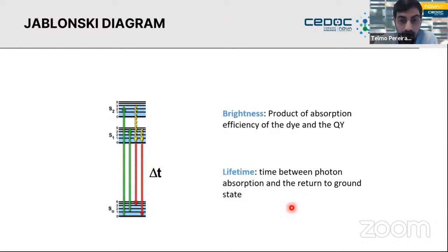There is a whole form of fluorescence microscopy called fluorescence lifetime microscopy, also known as FLIM, where you can read this time as well as the fluorescence, and this will allow you to draw different conclusions about your samples.